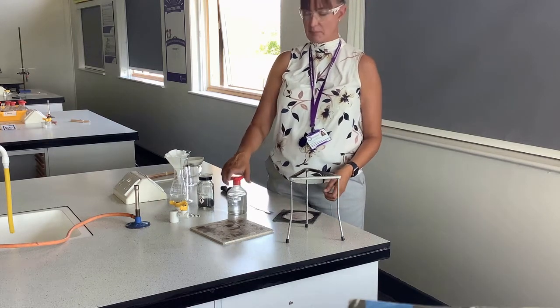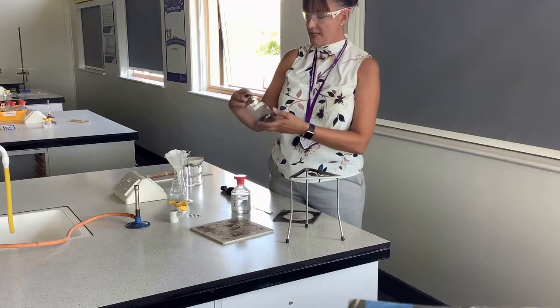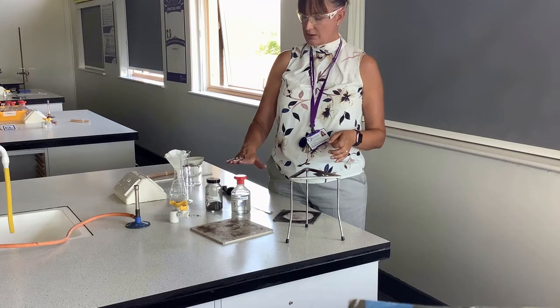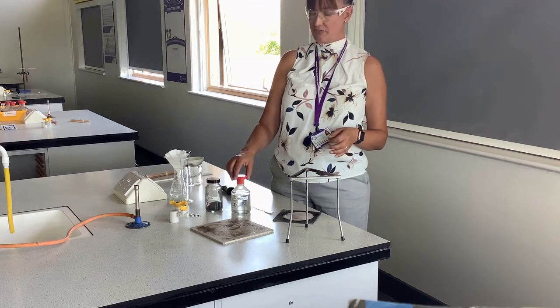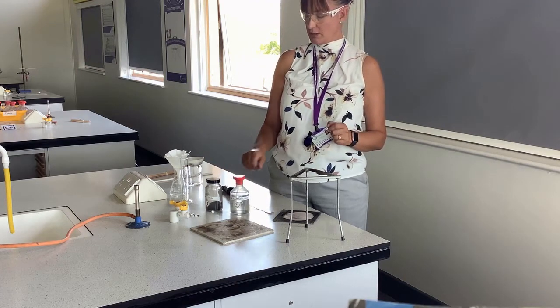This is an acid-base reaction. For this one we're going to use sulphuric acid, and for our base we are going to use copper oxide. The sulphuric acid and the copper oxide will react to form the salt copper sulphate, and as you will have seen before, copper sulphate is a blue solution that's soluble in water.